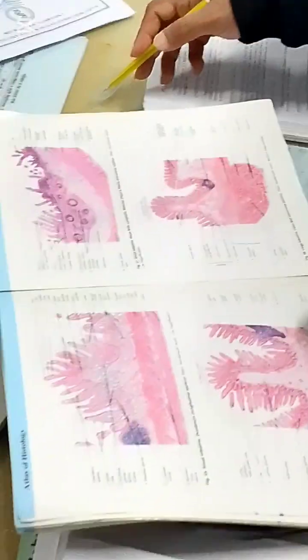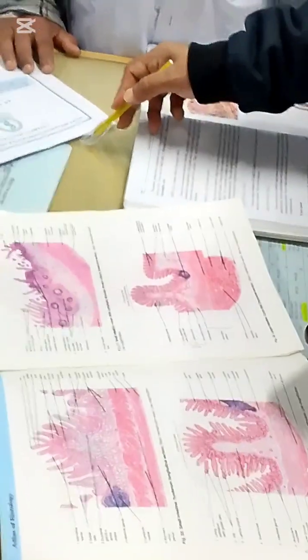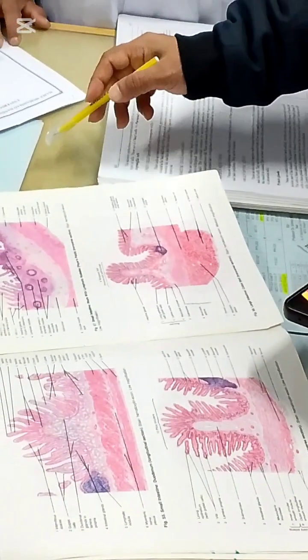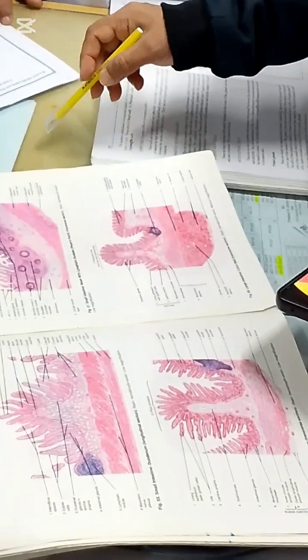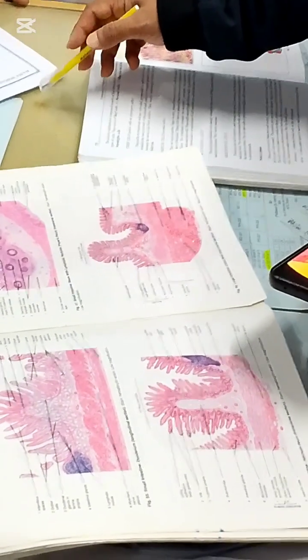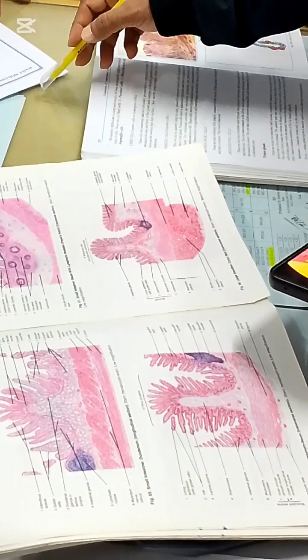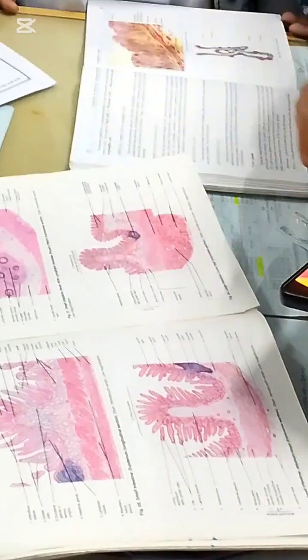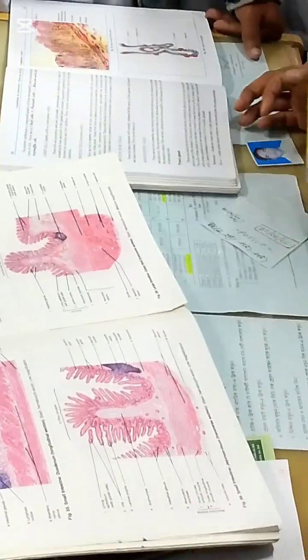Sample number in column 1, identifying point in column 2, organ in column 3. Then you have to write in the exam, in column 2, the identifying point: submucosa. Organ: colon.